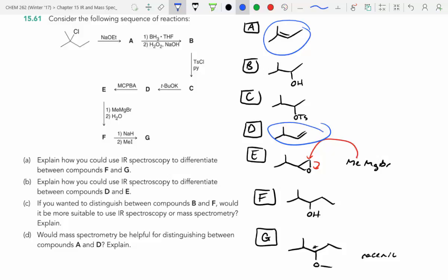Those aren't very happy. However, if we look at D, what happens if I pluck off this methyl group? We've got a resonance stabilized cation. That means we'd have a really, really strong fragment correlating to loss of 15 on D, but not on A. So you can actually use the fragmentation patterns to help determine which of the two isomers you would have.